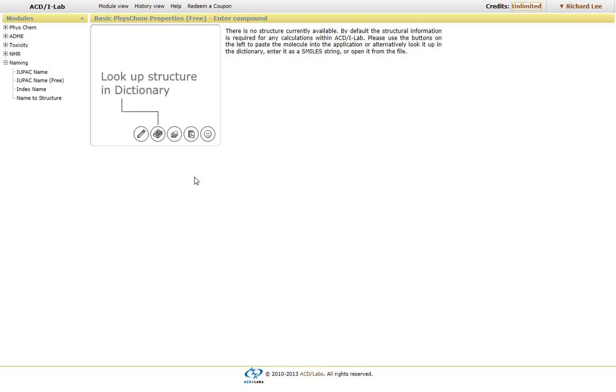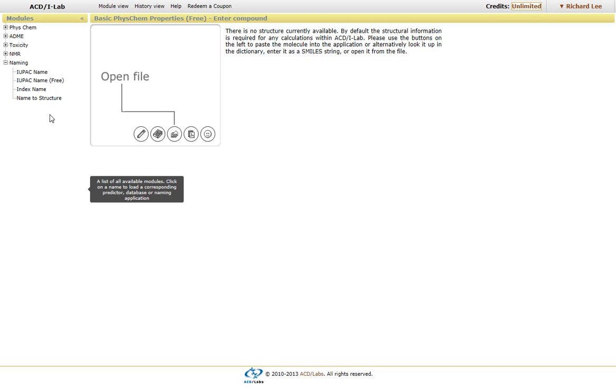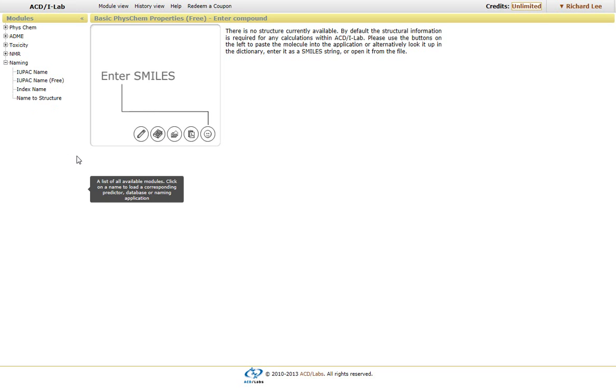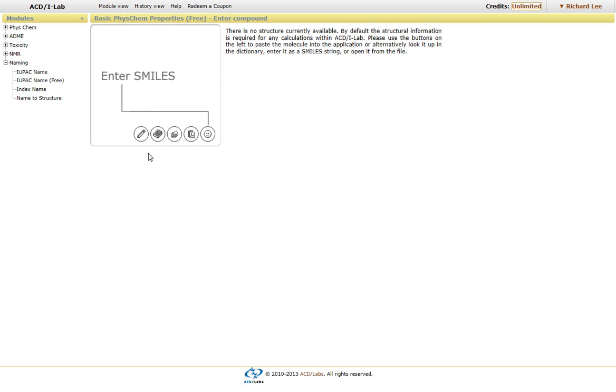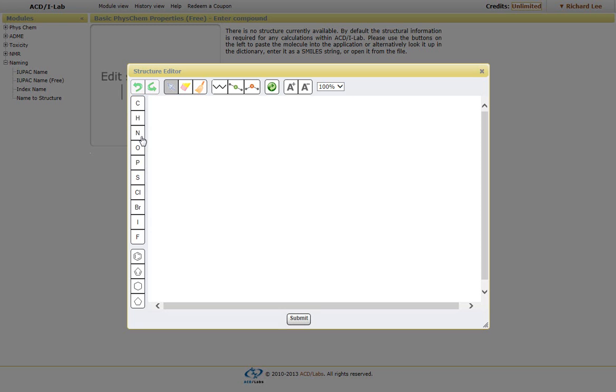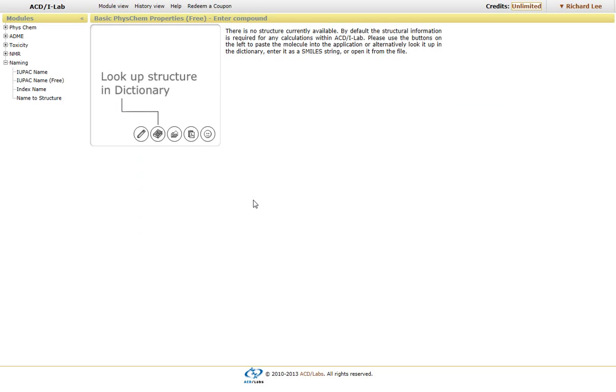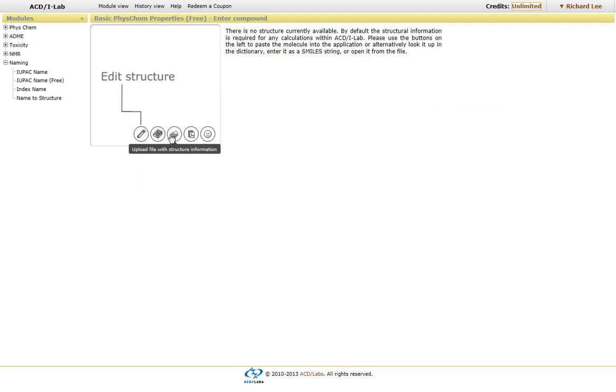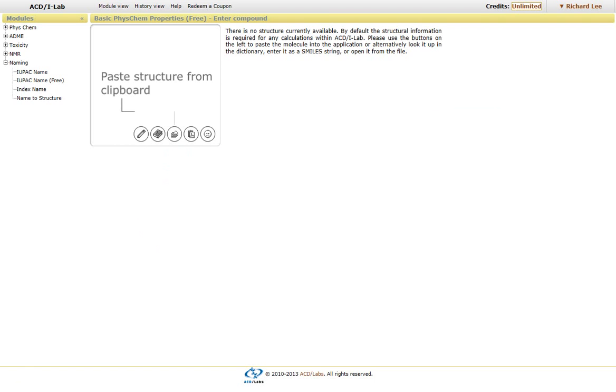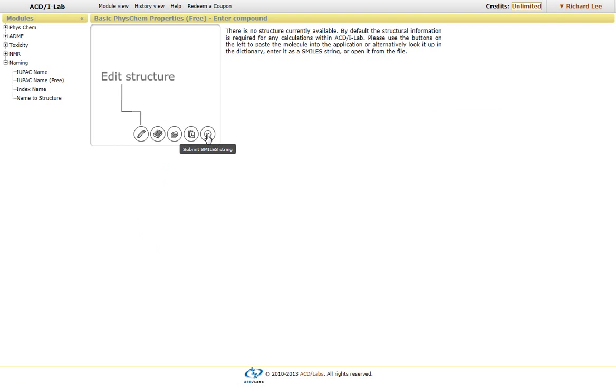On the left-hand side, we see the naming module. Just to the right of it, we have options for importing or drawing the structure itself. You can open up a drawing interface, look it up in our dictionary which has over 160,000 names, import or upload a file (whether it's a mole file or a ChemSketch file), copy and paste, or enter a SMILES notation.